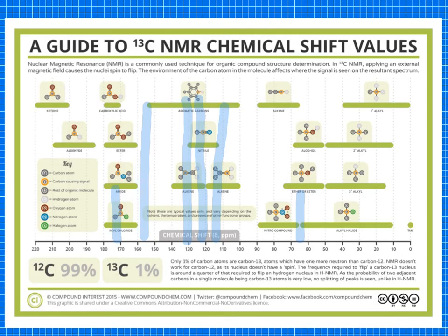The next thing we're going to analyze is the carbon-13 NMR chemical shift. I went ahead and put some of the values that are going to be shown in the next slide right here on our graph, just to show how I labeled our different carbon environments. The ones I just circled are our functional groups that I drew in our molecule. Between 60 and 70 we have the ether, and between 170 and 180 we have the amide, and then the rest of the carbons fall in this aromatic range, which we will see as I label the carbon environments in the next slide.